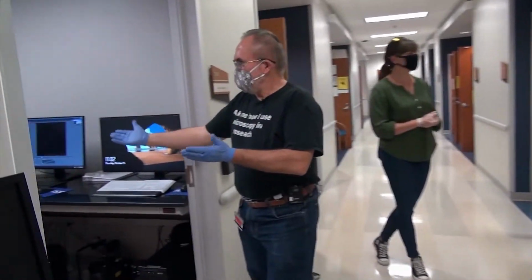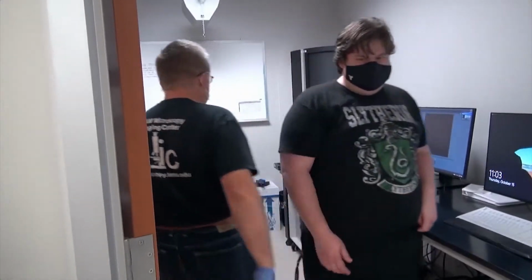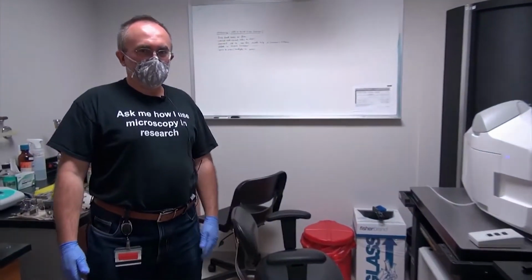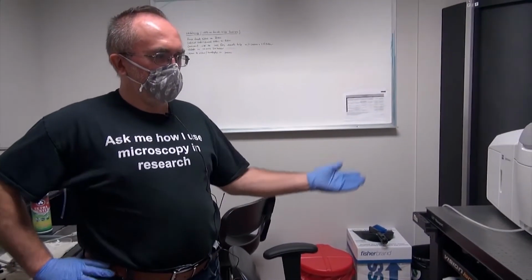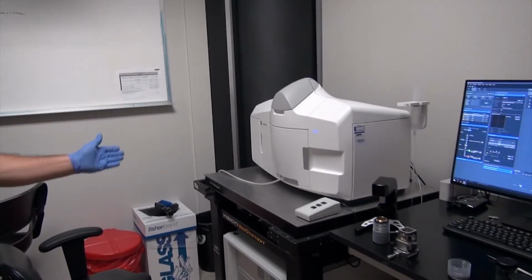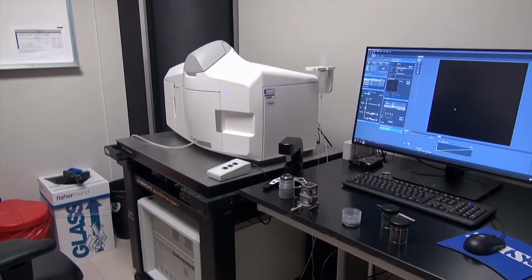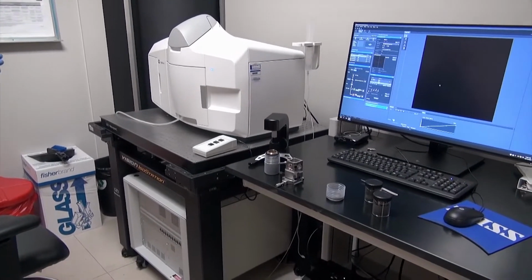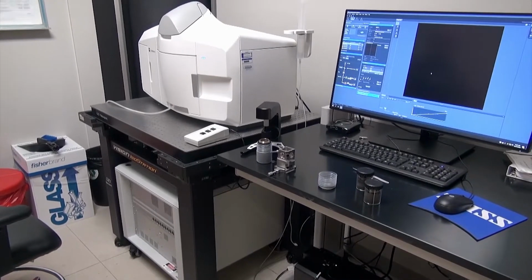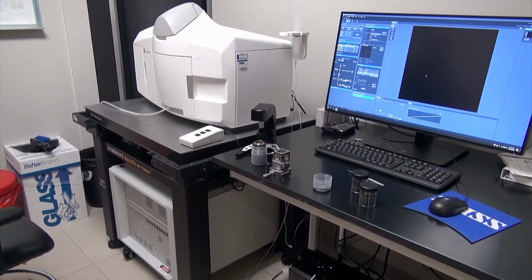Now, allow me to show you our first, and you can stay where you are. This is great. Our first optical microscope of this tour. This is the Zeiss Lightsheet microscope. This instrument focuses a sheet of light within a sample to illuminate a single optical plane. That's then imaged on a camera. And it allows very high speed imaging or volumetric imaging, 3D imaging.